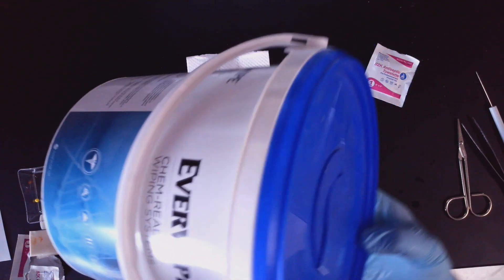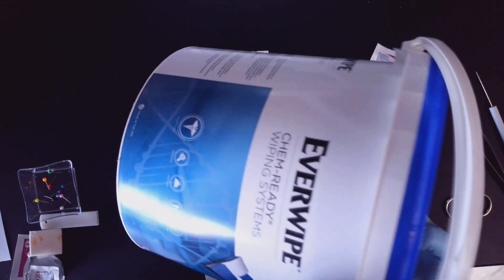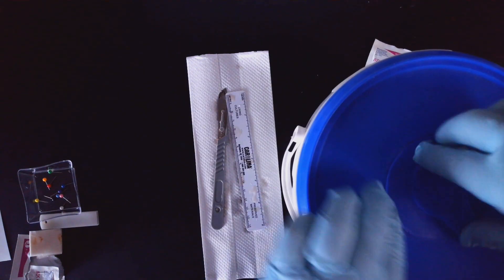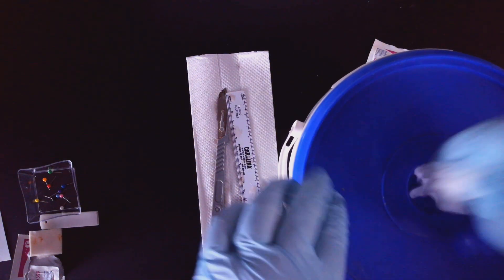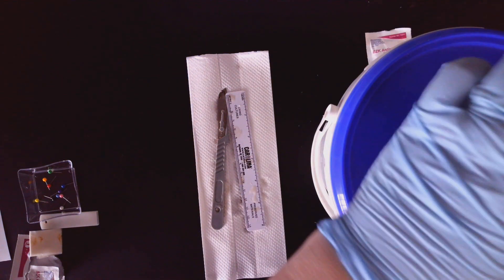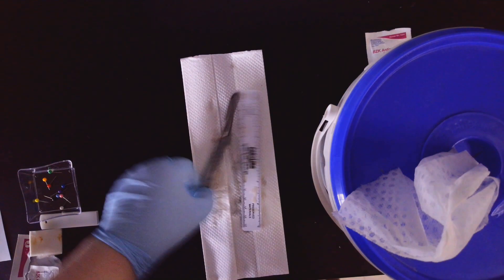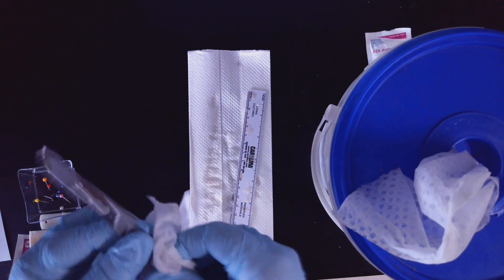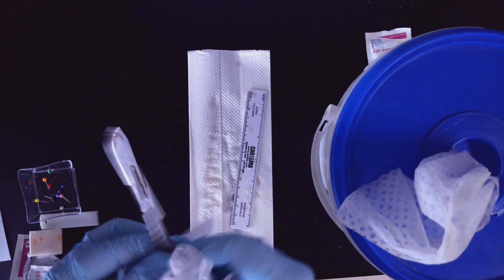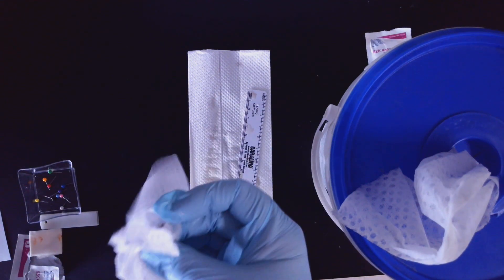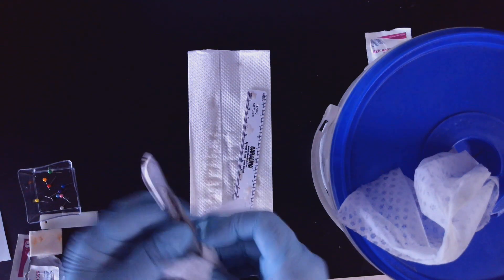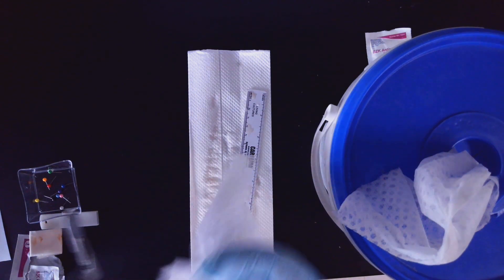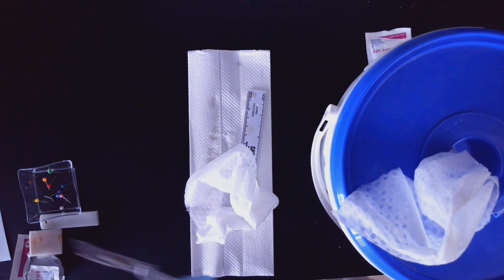We are going to use these wipes right here. So we're going to take the scalpel and we are going to wipe it off, and we're going to set it on a clean paper towel.